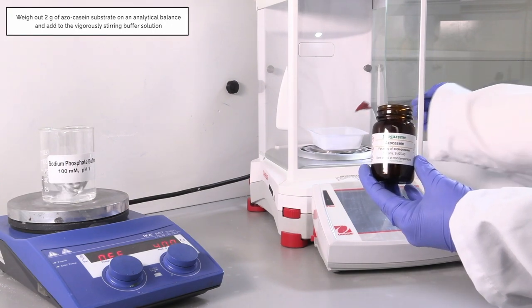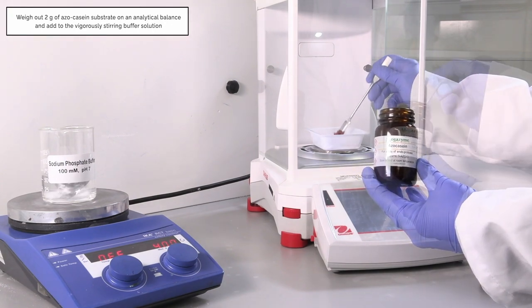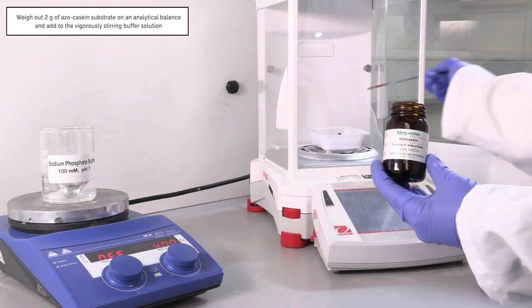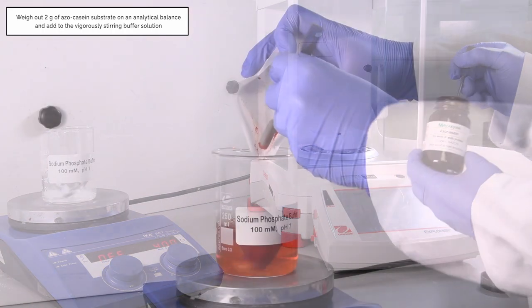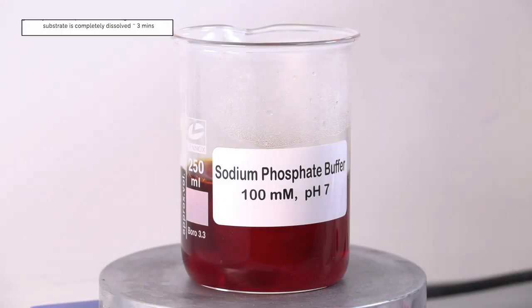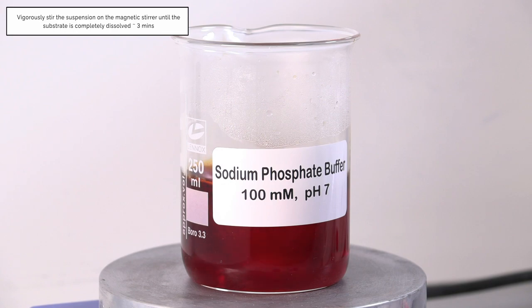Weigh out 2 grams of azo casein substrate on an analytical balance and add to the vigorously stirring buffer solution. Vigorously stir the suspension on the magnetic stirrer until the substrate is completely dissolved, approximately 3 minutes.